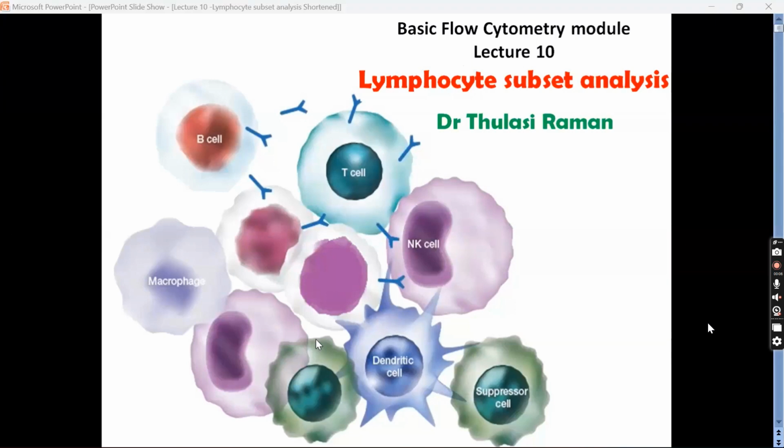Sir, will you be telling about HLA B27 also? Actually, B27 is nothing. I just showed you during the class of analysis. If you want, I can show you a case, but it's nothing. You just need to gate the lymphocytes and see whether it is positive or negative.